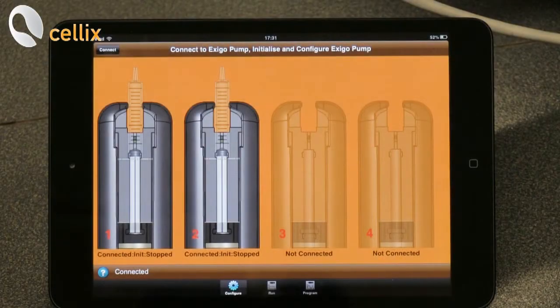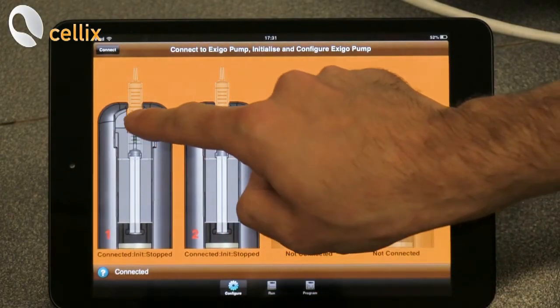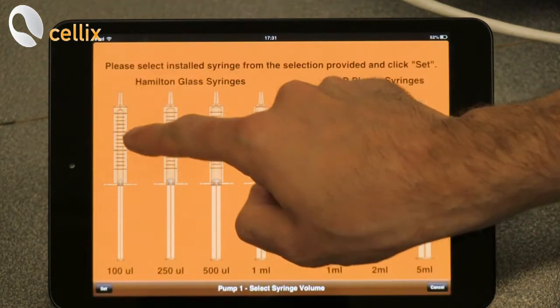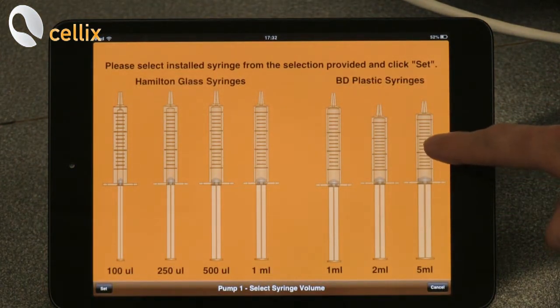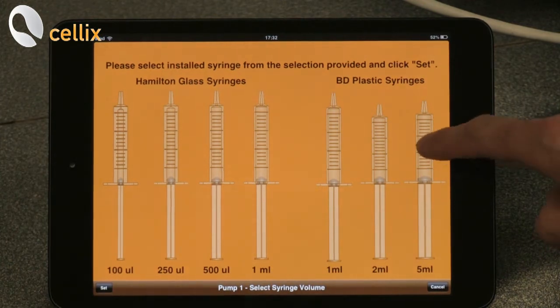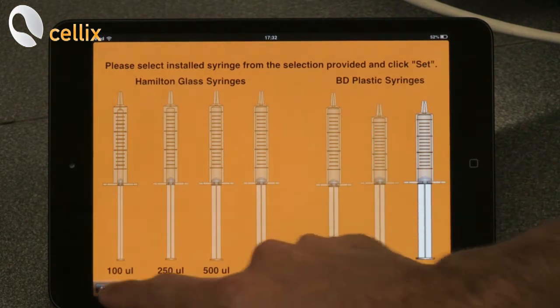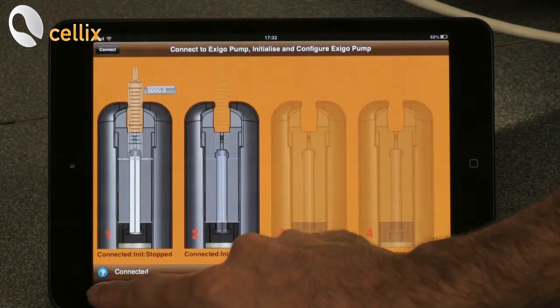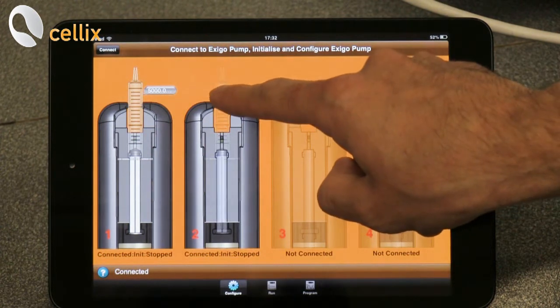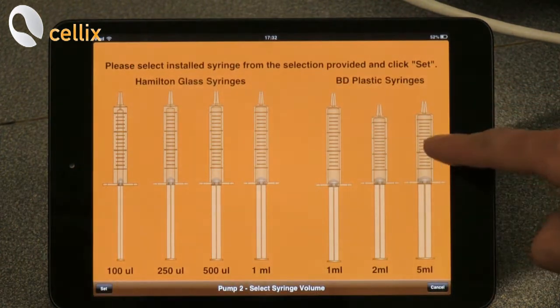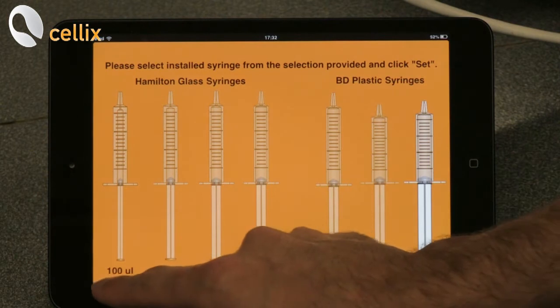The next step is to select the syringe. We double click on the syringe and we select five milliliter syringe because it's the dimension of the syringe we are currently using. Select the syringe and then set. We do the same operation for the second pump. We double click, we select the syringe and then we click set.